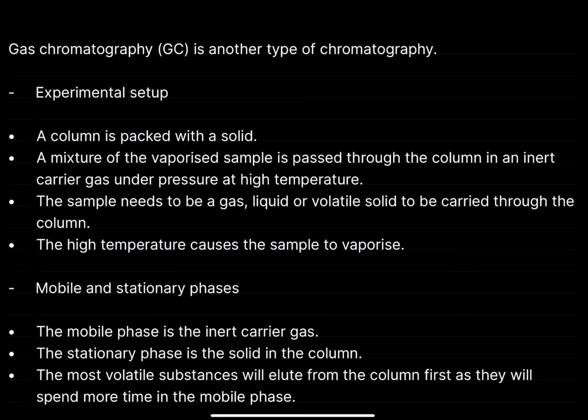You have to vaporize a compound in mass spectrometry anyway, and gas chromatography already does that for you. So you can just attach a gas chromatography mechanism. I shouldn't say chromatogram; a chromatogram is what you get after chromatography. You can attach a gas chromatograph to a mass spectrometer, and then using both of those together, you can split and identify specific compounds from a mixture.